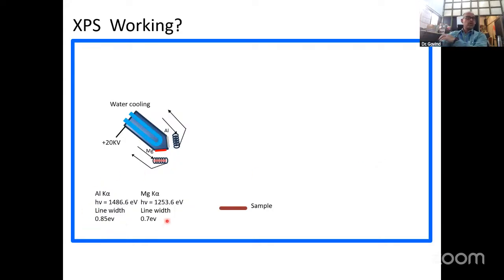Okay. So if we want more resolution than 0.7 or 0.8, we require a high energy source. But most of the time magnesium and aluminum are used because they suffice for all the activity. They identify the entire elemental mapping. So that's why it's commonly used.